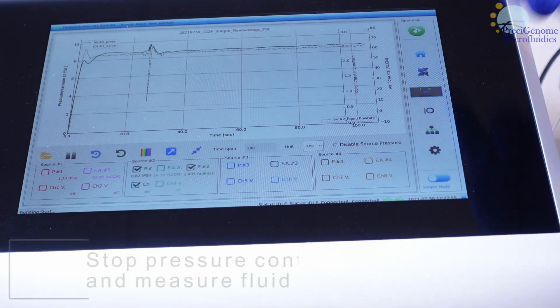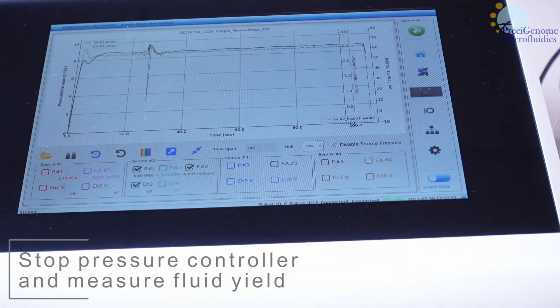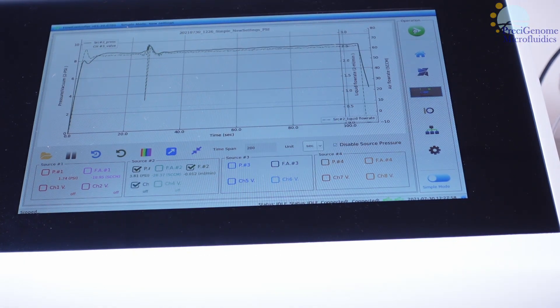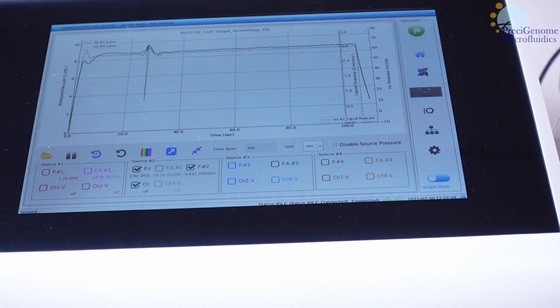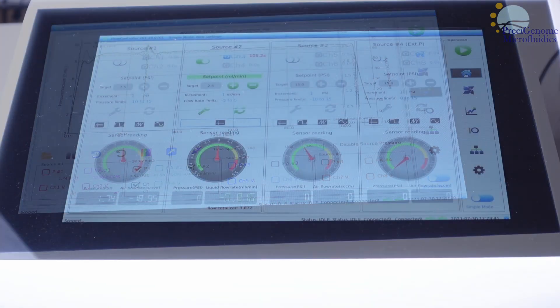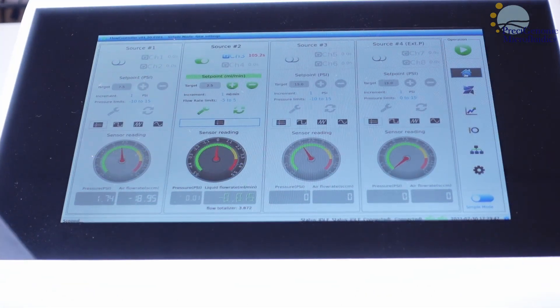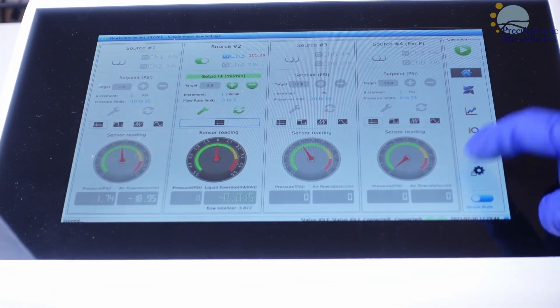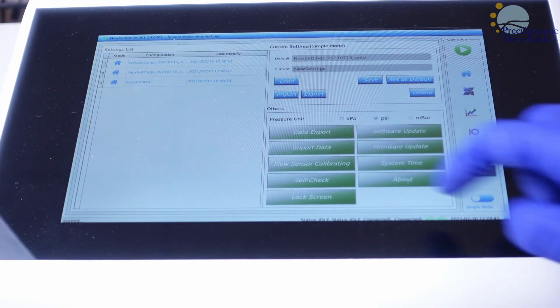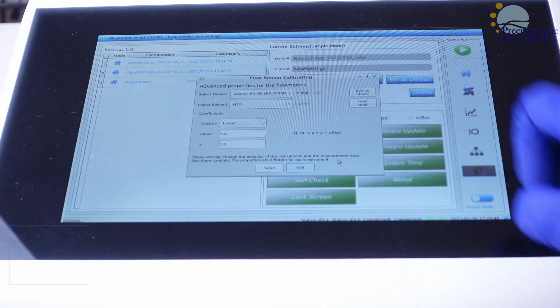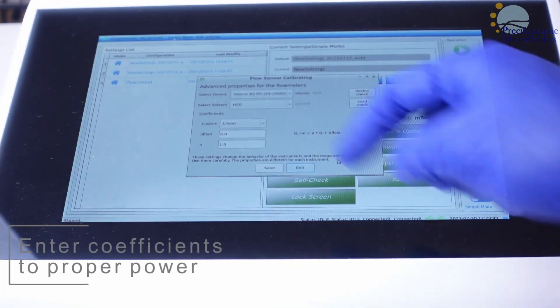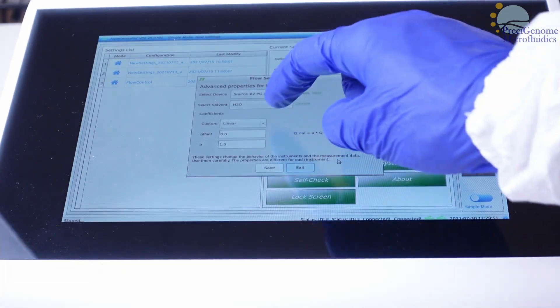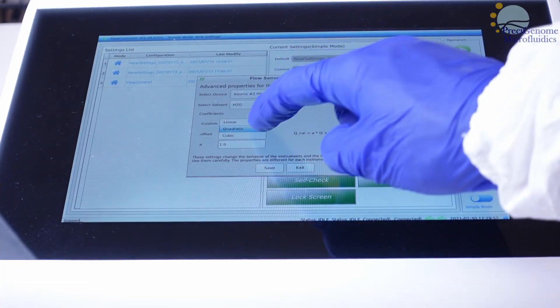When this is finished, measure your fluid yield, either by weight or observation. Once you have your equation for true flow rate from target flow rate, go to Flow Sensor Calibrating. Enter the coefficients you calculated to calibrate your device.